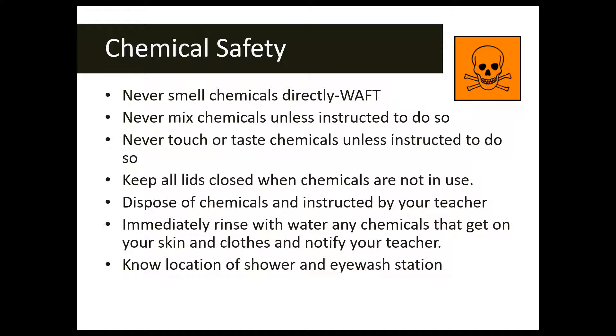Never mix, touch, or taste chemicals unless instructed to do so. When not working with your chemicals, make sure any lids are closed — many chemicals are expensive and we don't want them spilled. If you get any chemicals on your skin or clothes, immediately rinse with water and notify your teacher. Most chemicals must be disposed of in a special way — not all can be washed down the drain or thrown in the trash — so follow your teacher's disposal instructions.